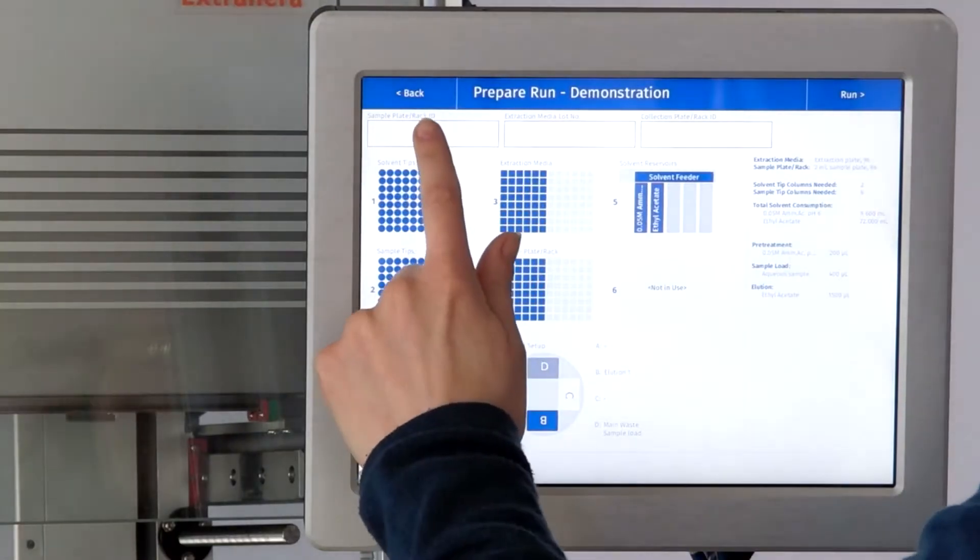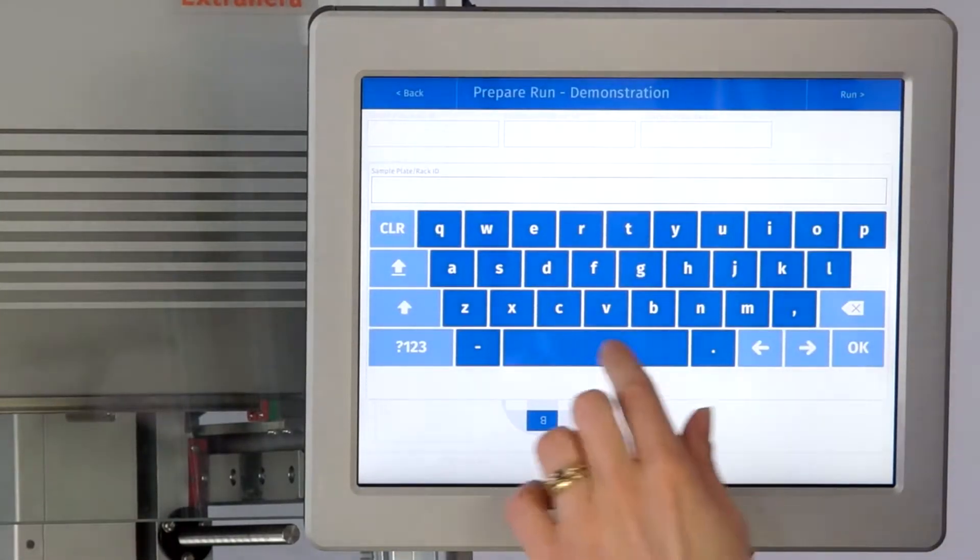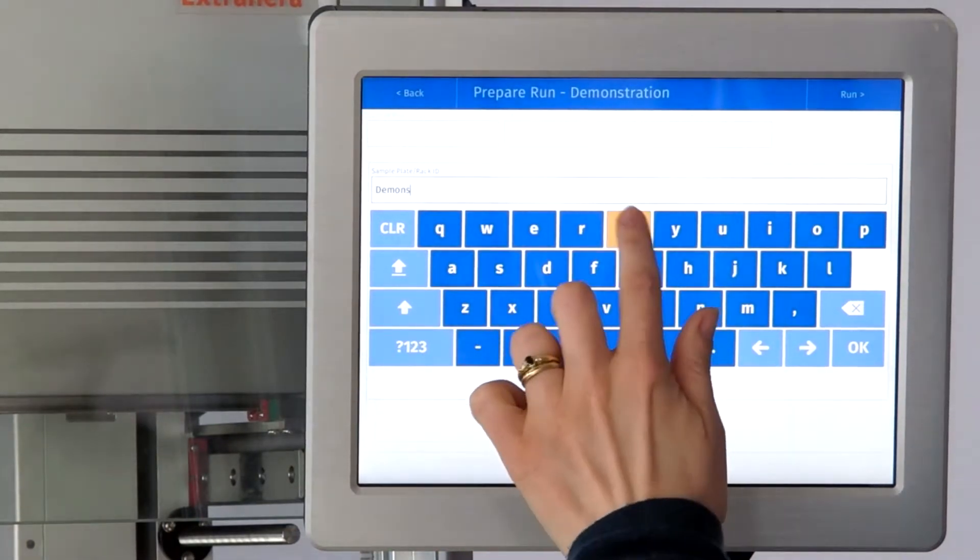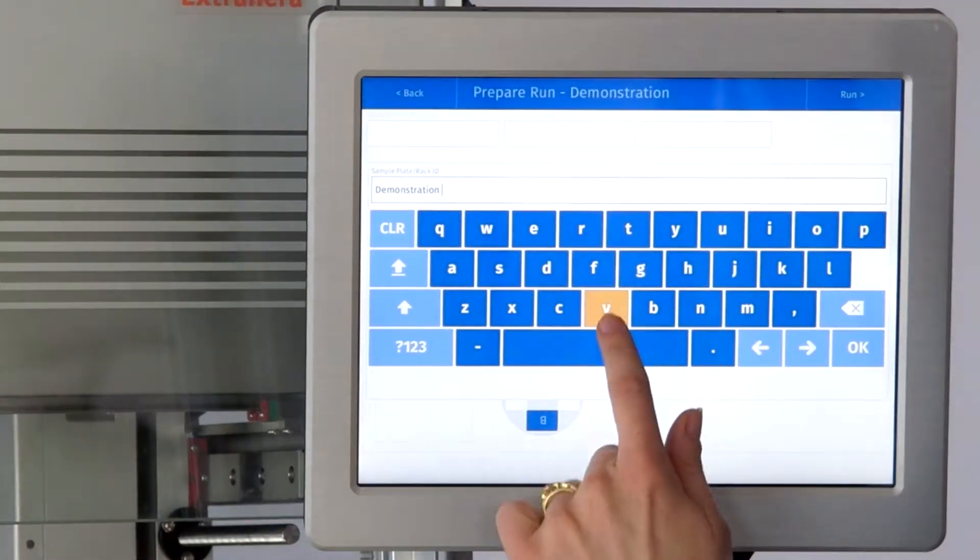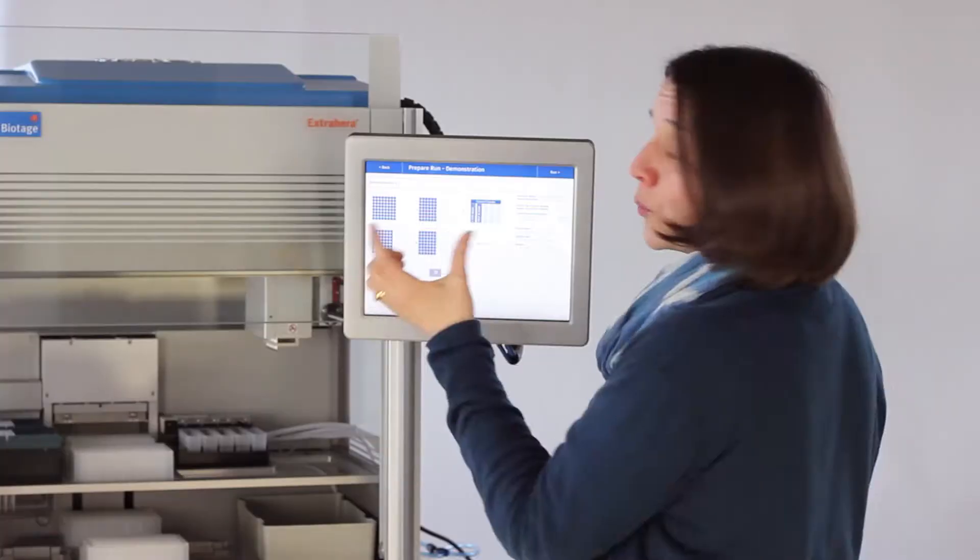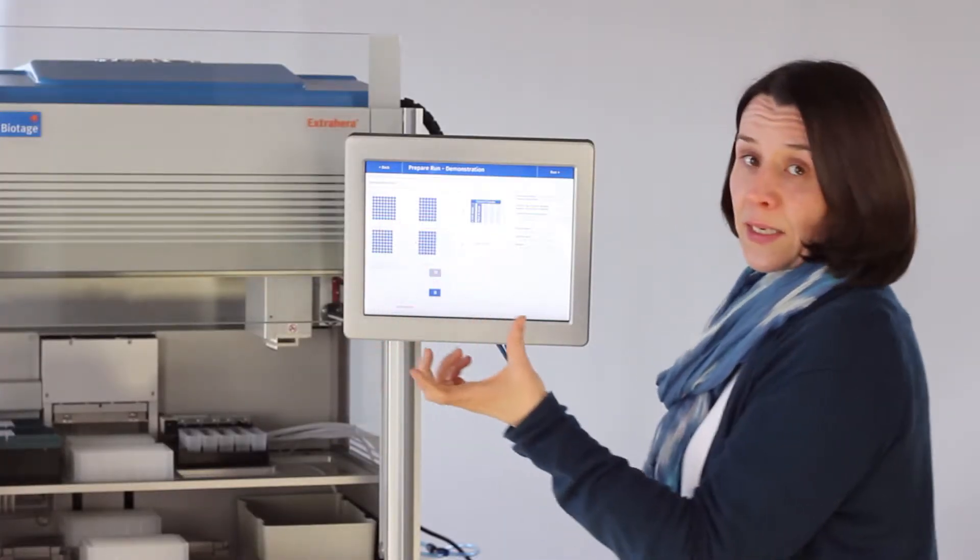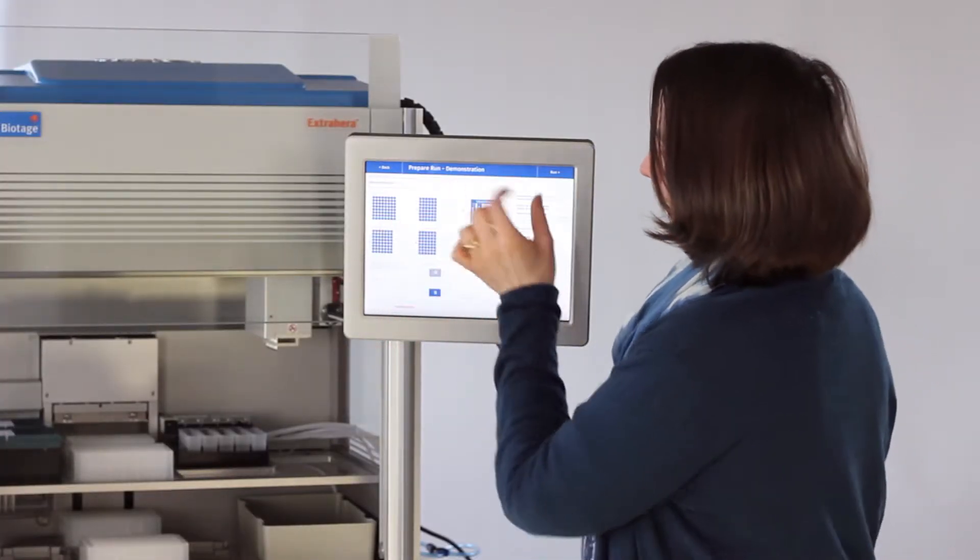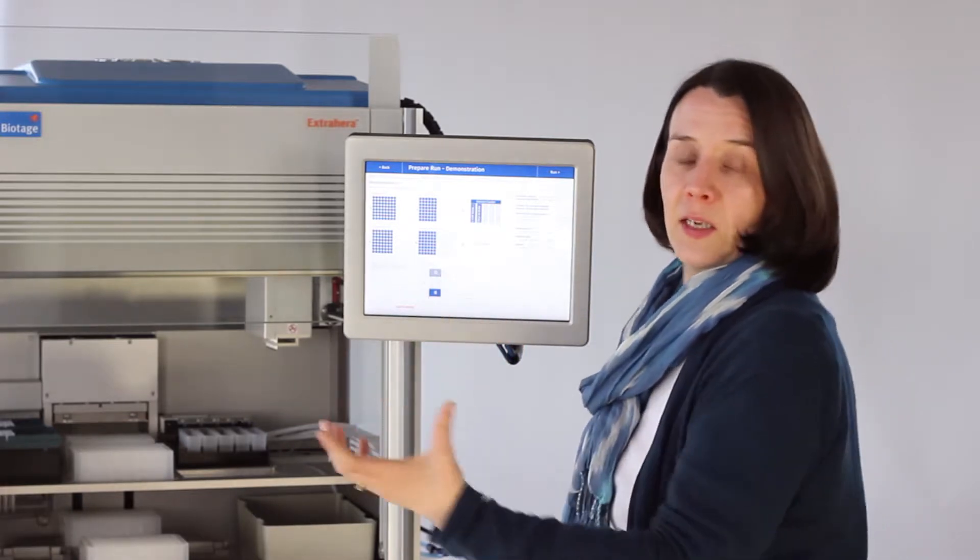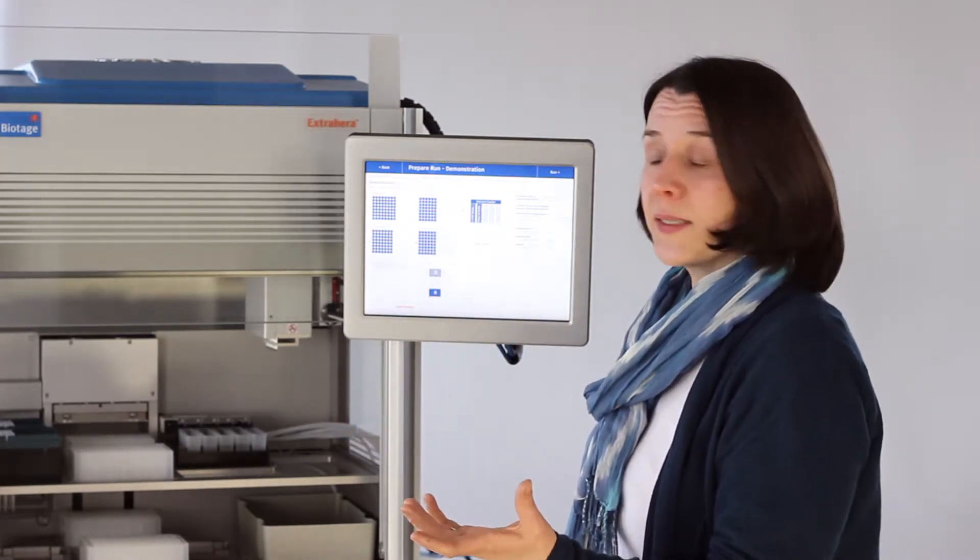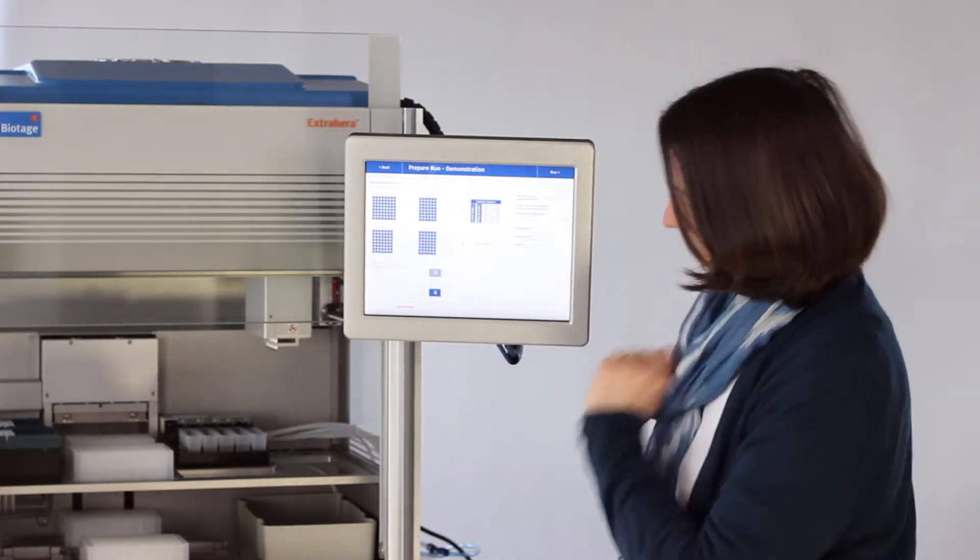You can give the plate a name, so we'll call it demonstration version 1. If you wish to put the lot number of the SLE or SPE plate you can, and if you have a collection plate ID such as a barcoded plate you can put it in this section.